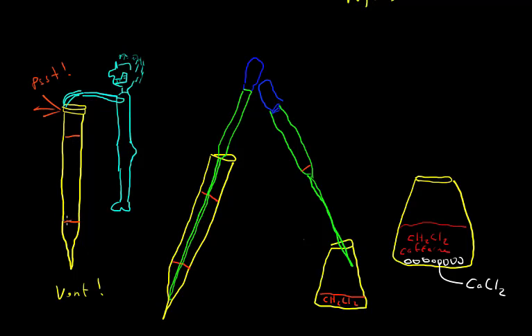So we're going to be doing this in the fume hood. When you vent this, you just pull the cap up on one side away from you, in the direction towards the back of the fume hood, so that if anything sprays, and it probably will since this is wet up here, it sprays away from you. So don't have this pointed towards anyone, including yourself. Open it up towards the back of the fume hood, then snap the lid back on and continue shaking. You want to do that about 2 or 3 times. Once you've done that 2 or 3 times at the beginning of the extraction, the solution is no longer getting warm and you no longer have that buildup of vapor pressure. So don't forget to vent the solution.